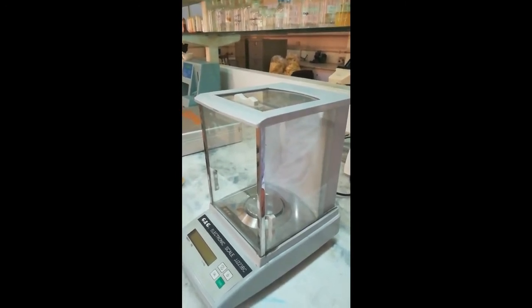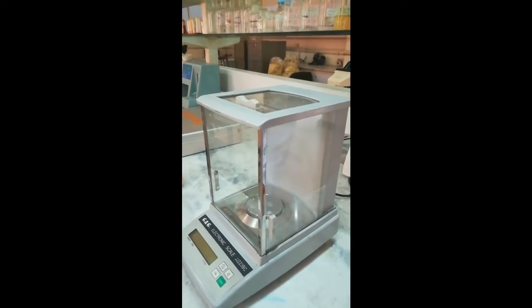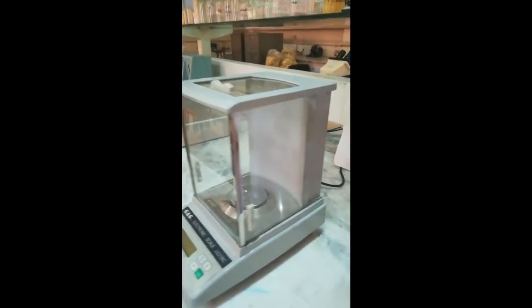The first equipment is the top loading balance. The top loading balance must be placed at a level place, and we can level it with the help of this mercury. The mercury bubble should be in between the red circle.